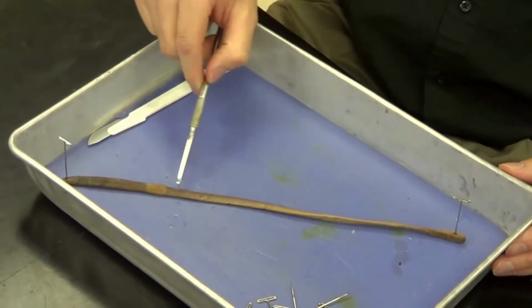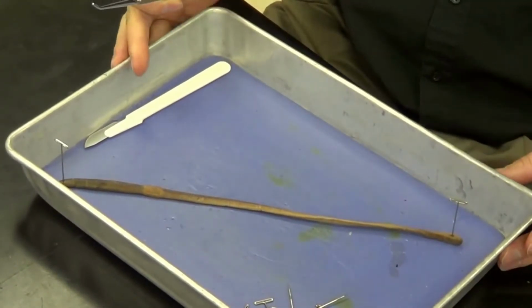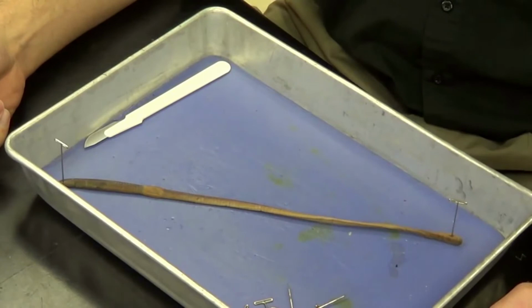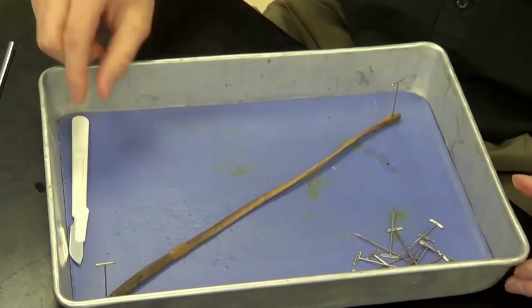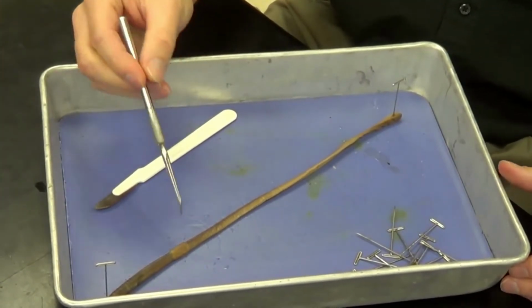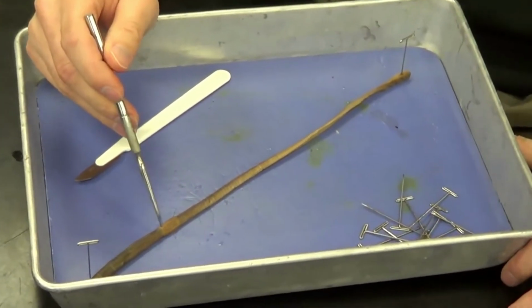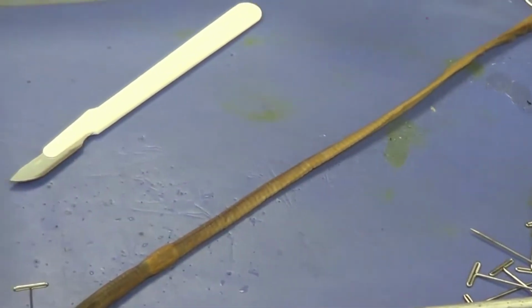This is the dorsal side of the earthworm. The underside, or belly portion of the earthworm, is the ventral side of the earthworm. So now we're going to go ahead and get to our dissecting. So we've got our scalpel. Note the clitellum right here. I want you to begin your dissection posterior. So anterior is headward, posterior is towards the anus.